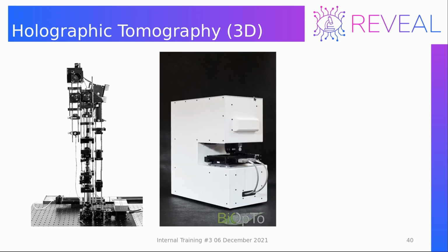So this is our second holographic tomography setup. We rebuilt it and enclosed it into this casing, so it is no longer so scary. It is the size of a slightly bigger microscope, so it's not that big. However, it is quite heavy. This element here is the motorized stage that we use to capture information in a wide field of view.